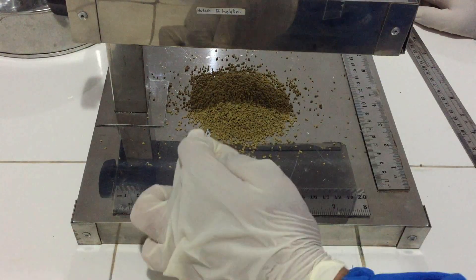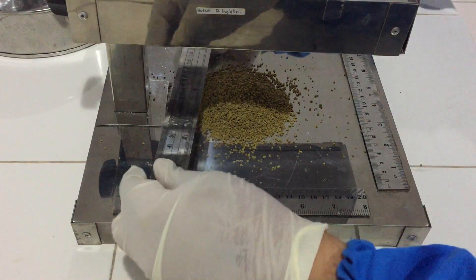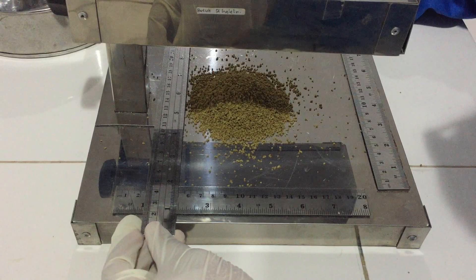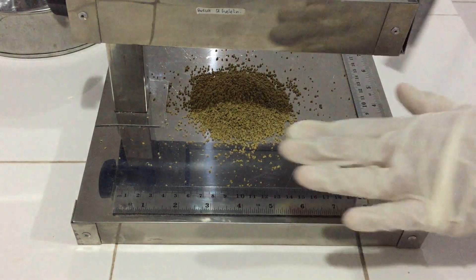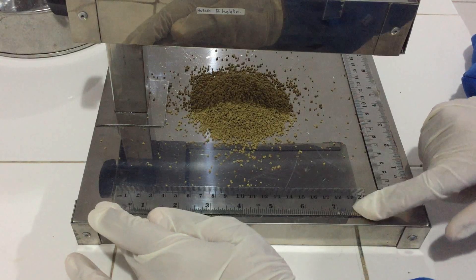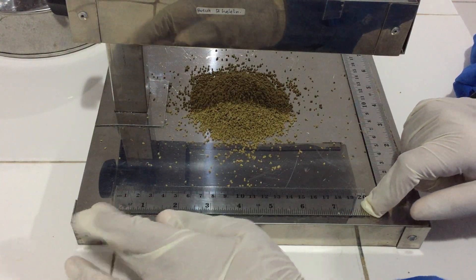Baik, dari sisi sebelah sini kita ukur juga. Tepat di nomor 5, kemudian yang disini juga di 15. Jadi sisi sini itu sama dengan sisi belah sini. Granul, cukup sekian dan terima kasih. (From the other side we also measure: from 5 to 15 — the result is the same as the first side.)